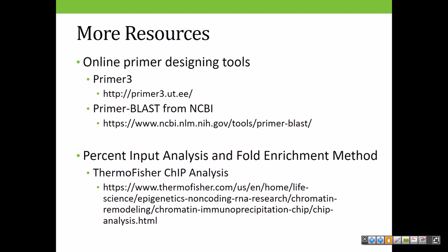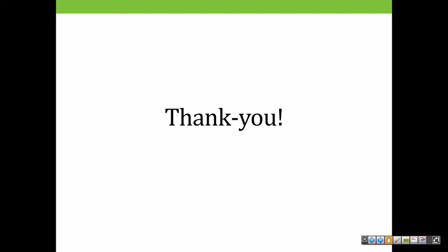And of course, for any questions about the math that I performed today for a percent input analysis, I've included a link to the Thermo Fisher website where I originally got the step-by-step instructions for how to analyze. They include both percent input and fold enrichment, so you can judge for yourself what you prefer. And with that, I'd like to thank everybody for coming, and hopefully this has been very informative.